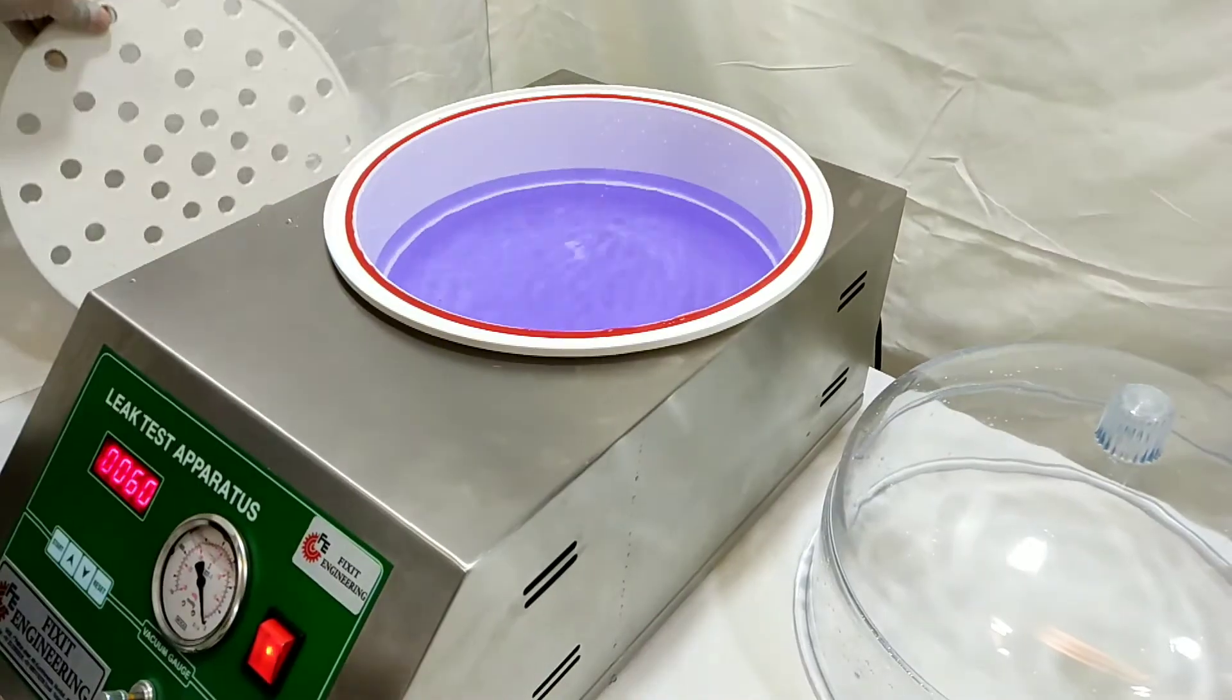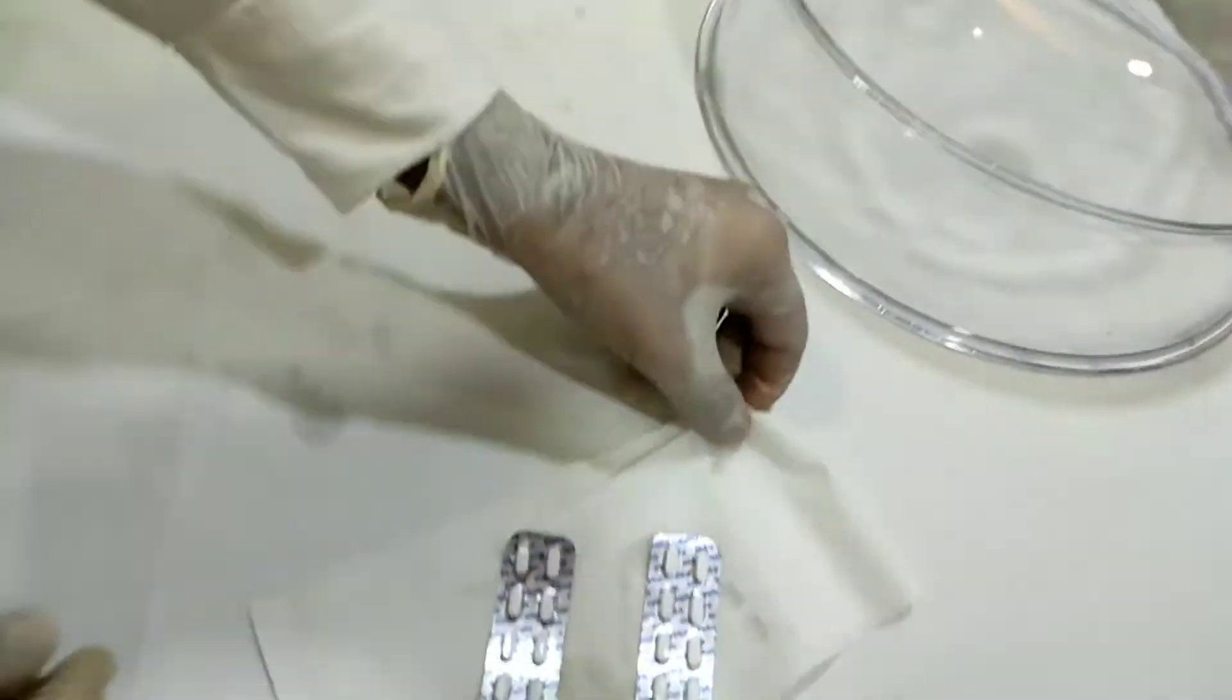At the end of trial, penetration of liquid inside the specimen can be observed.